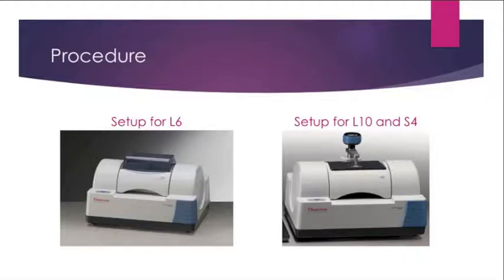The other liquid was dropped directly onto a platform of the spectrometer. The sample was then covered with a crystal and tested on the machine. The crystal did not have to come into contact with the liquid, but did need to be directly above it. The solid unknown was run the same way, except the crystal had to come in contact with the solid in order to get an accurate measurement.